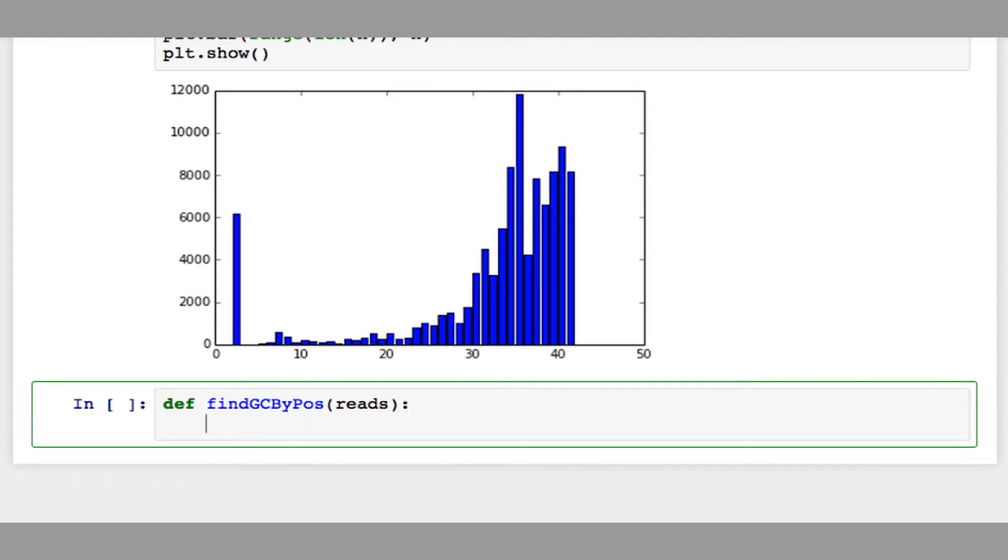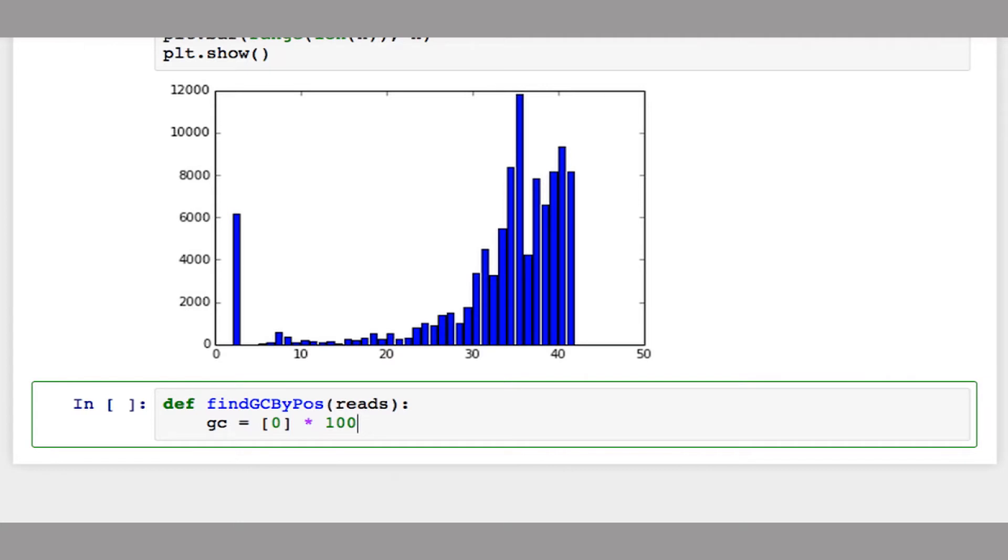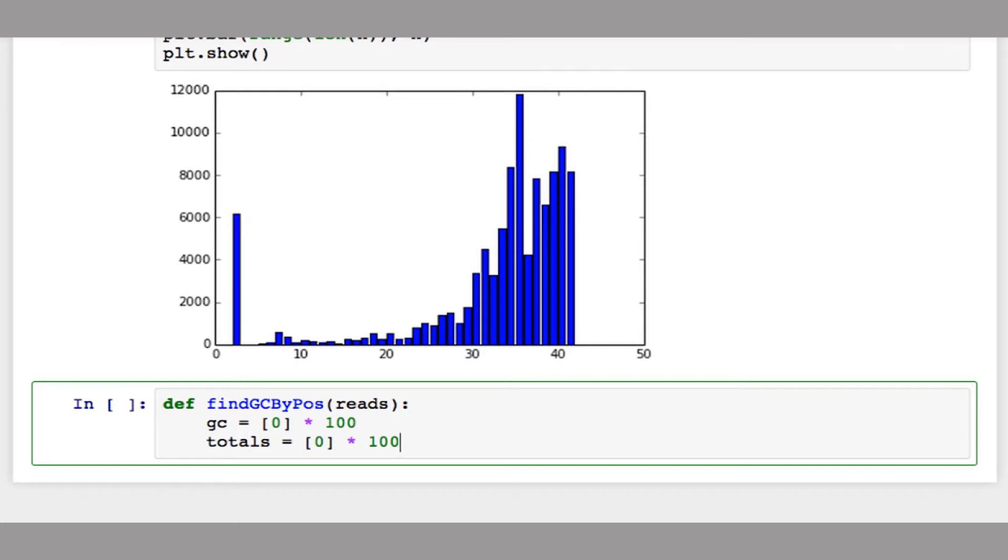I'm going to create two lists. One will track the number of GC bases at each position in the reads. In this dataset, all reads are length 100, so I'll make this list 100 long. I'll keep track of the number of GC bases and also the total number of bases at each position. Once I finish, I can divide at each index the GC by the total to get the average GC content at that position.